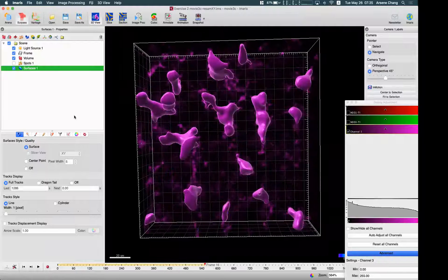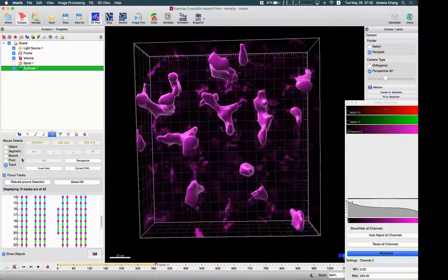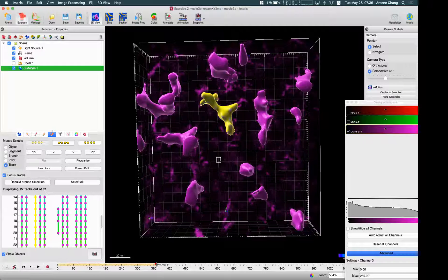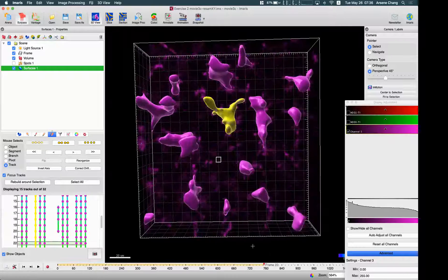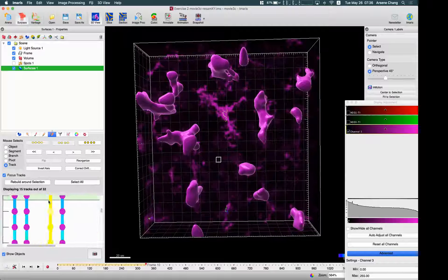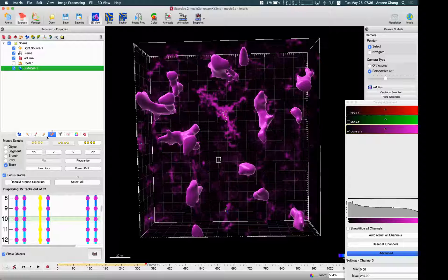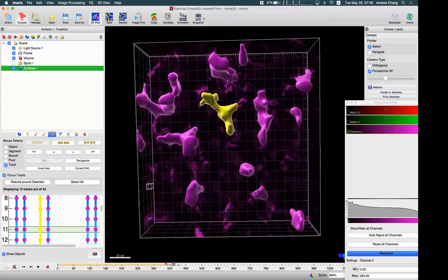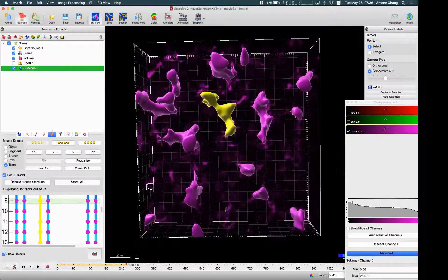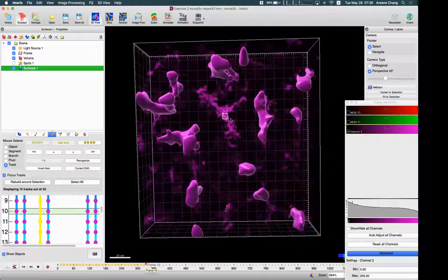So now we have the surface and the spots. Let me select a track — for example, this one. It's missing in the middle; as far as I can see there is a missing detection. But because we have the close gap option turned on, we can still track this object successfully even without the detection in the middle — like in this frame, we miss once.